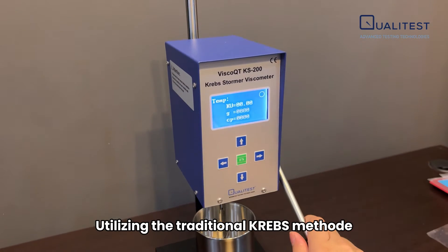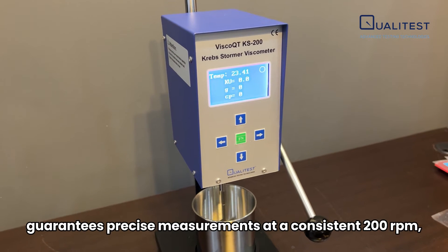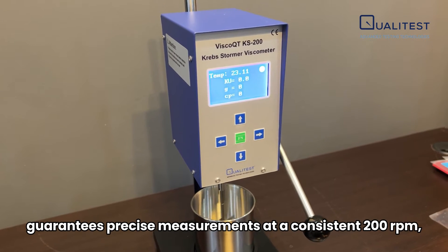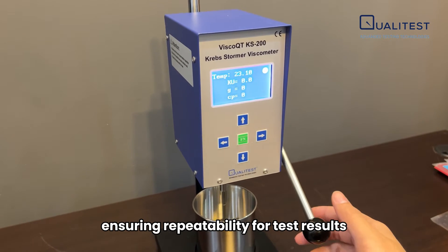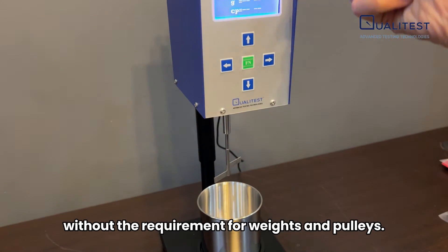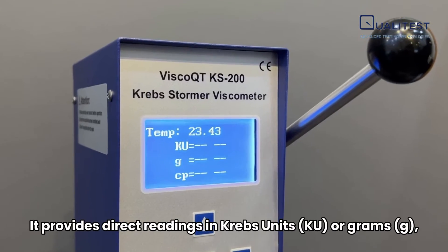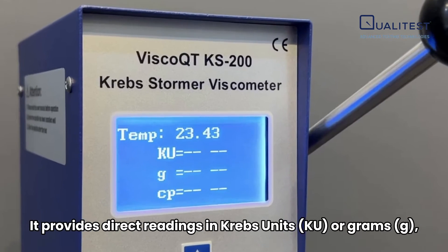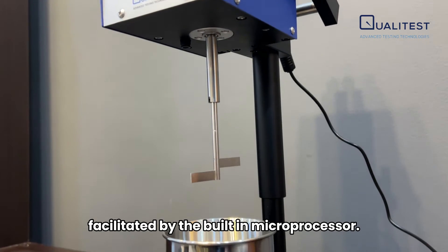Utilizing the traditional Krebs method as its foundation, our Krebs Stormer Viscometer guarantees precise measurements at a consistent 200 RPM, ensuring repeatability for test results without the requirement for weights and pulleys. It provides direct readings in Krebs units or grams, with automatic unit conversion facilitated by the built-in microprocessor.